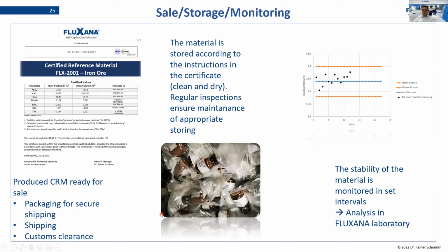And of course, we have to package it. We have to make sure that there is no problem in shipping, that the material is not destroyed, and we always try to seal the materials in a way that no moisture can come into it, so that over years it will be clean and dry, and nothing can happen.